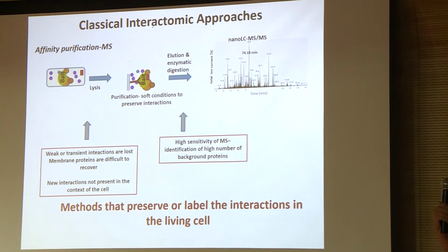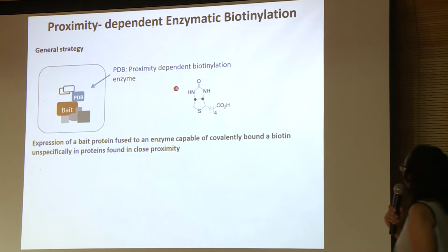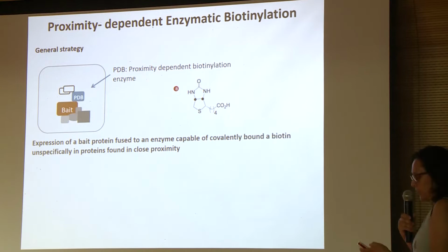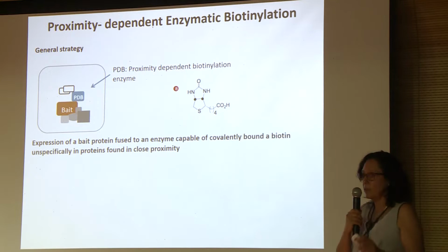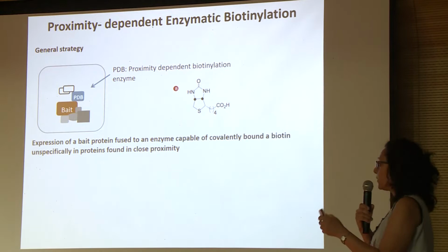This is exactly what I'm going to talk to you about, and this is called proximity-dependent biotinylation. The general strategy for this approach is to express in your system your protein of interest, the bait, coupled to a proximity-dependent biotinylation enzyme, that is the one that is going to be responsible for the covalent modification of the partner by introducing this molecule here, a biotin.